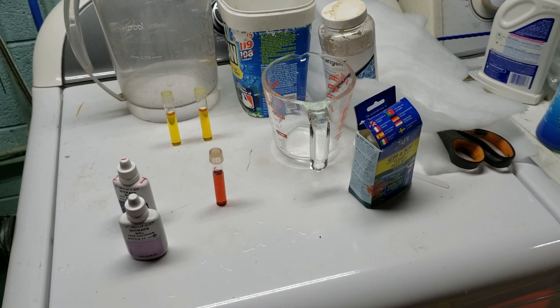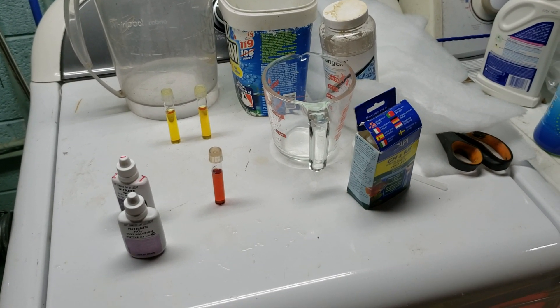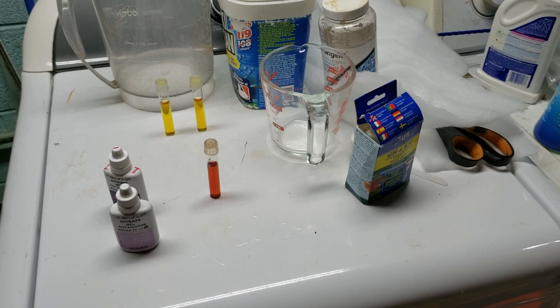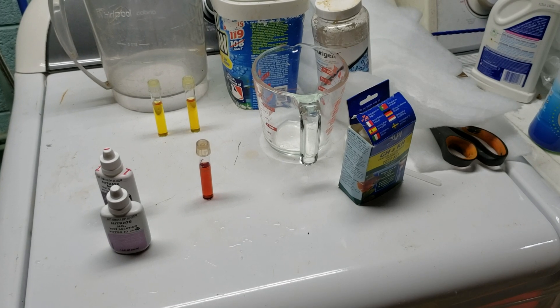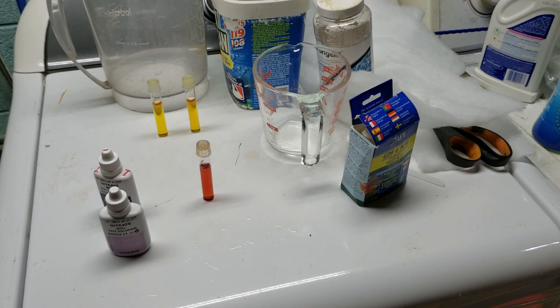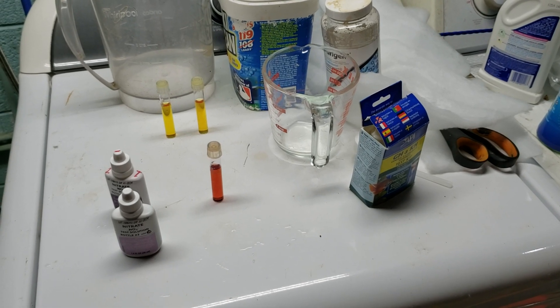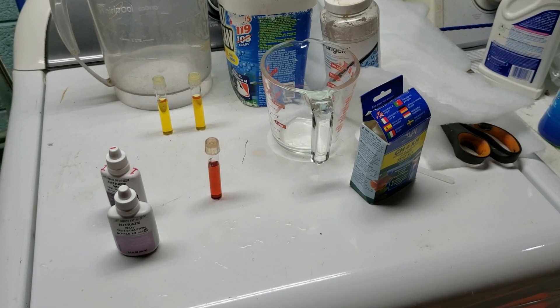Hey everybody. I'm gonna do another video here where we look at some colored vials for a few minutes. I shot a video yesterday where I was talking about the nitrate levels in my office tank that's got my German blue RAM in it, and a few people suggested that I check my tap water because I might have nitrates in my tap water.